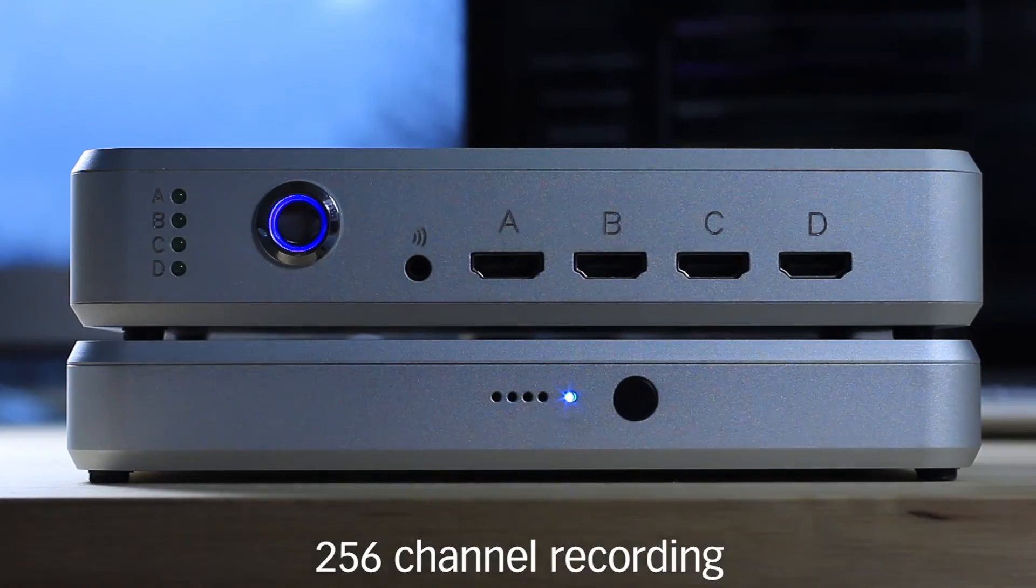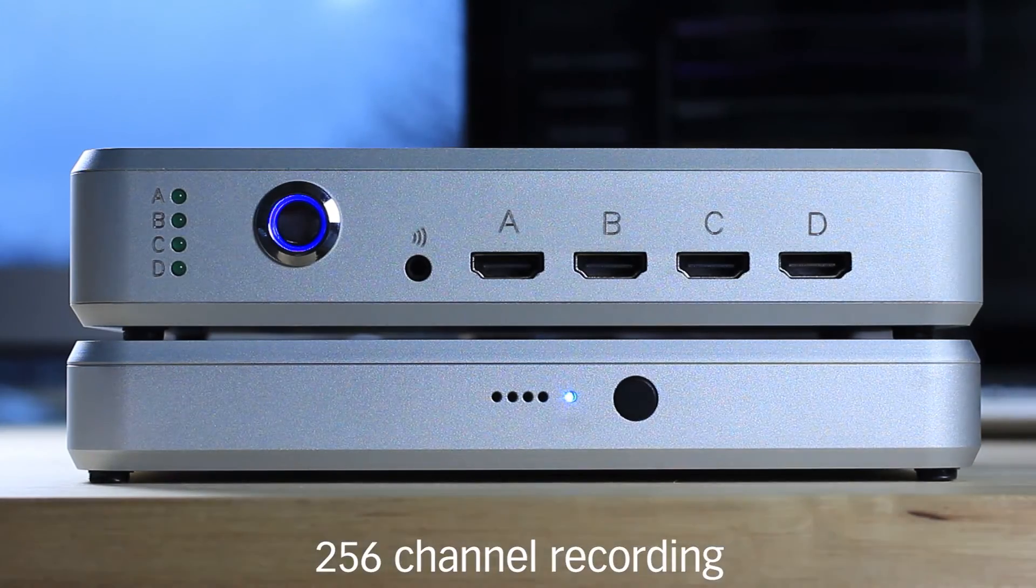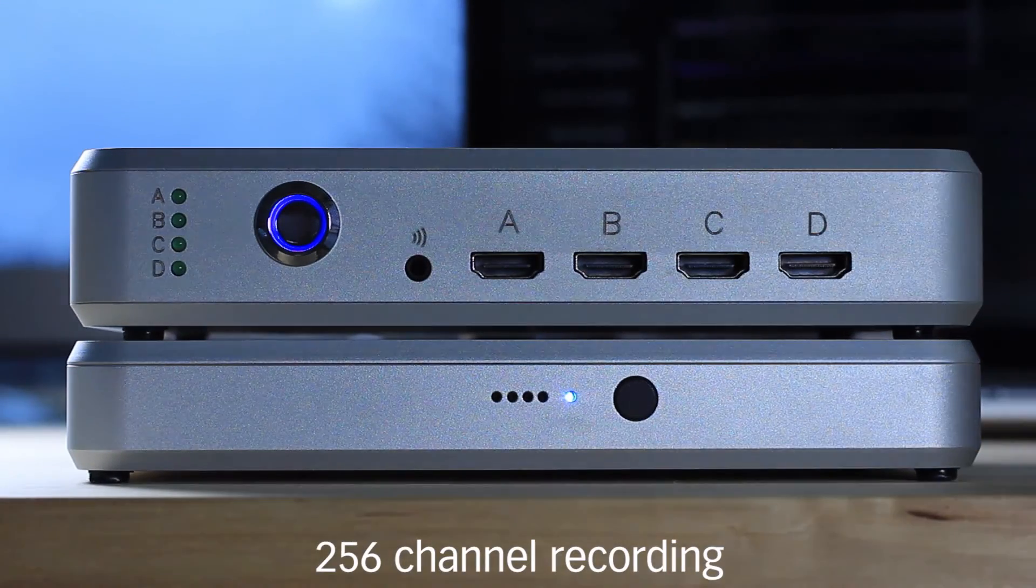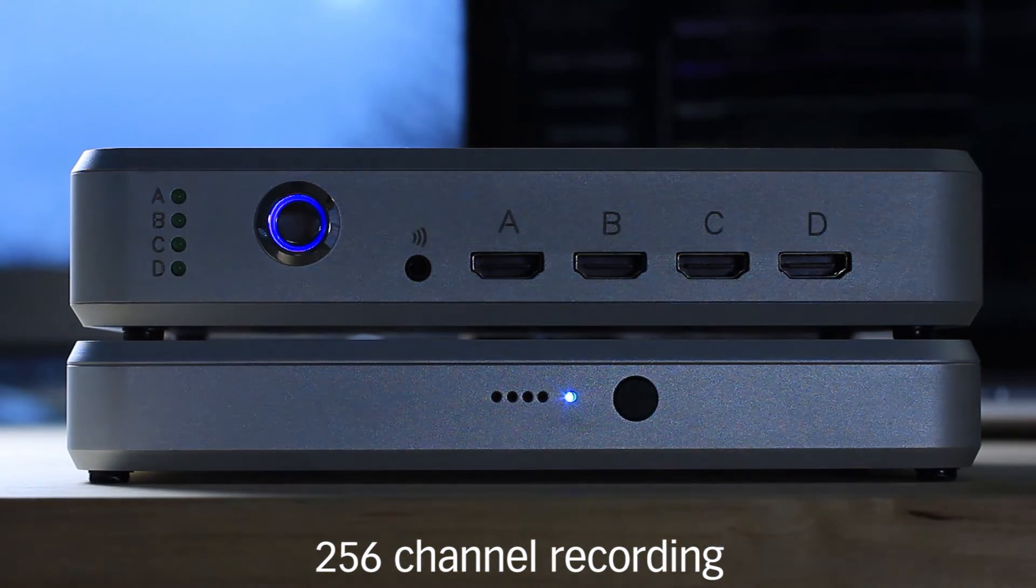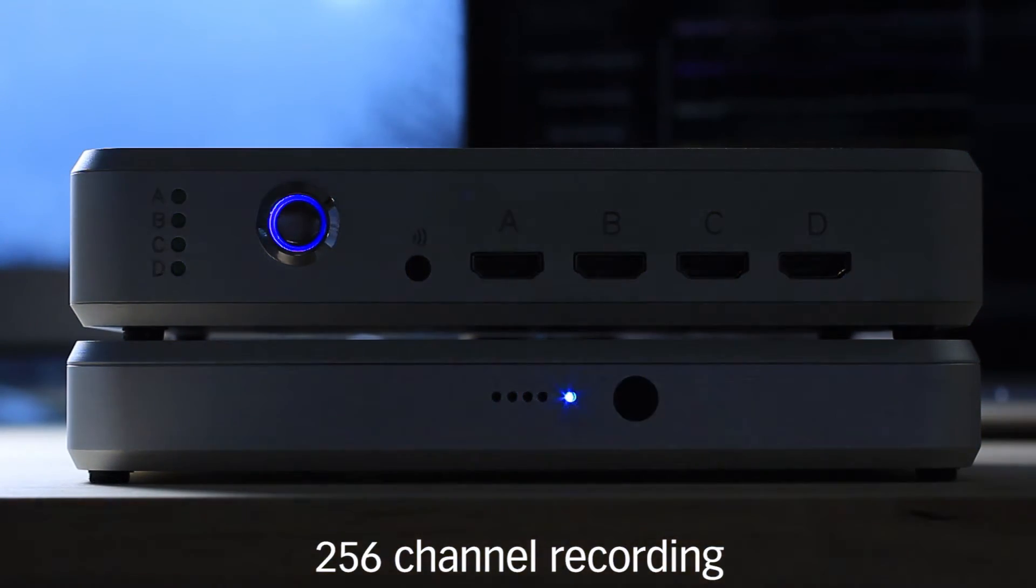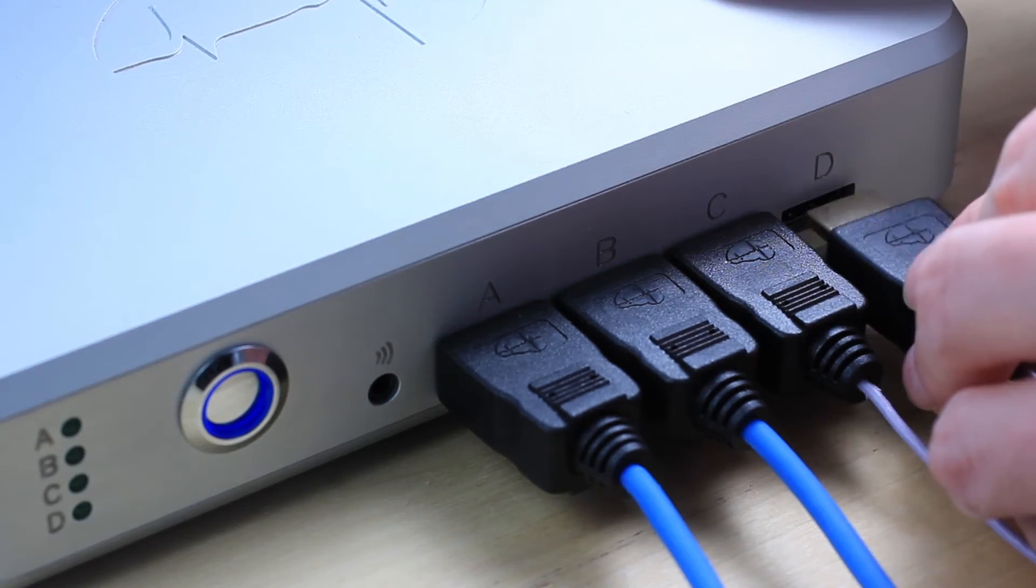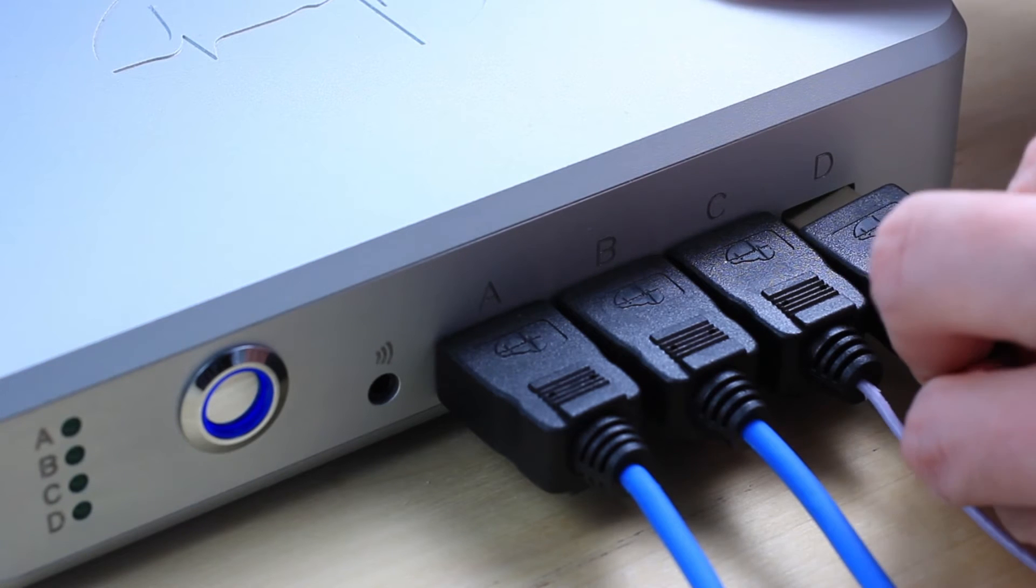The SmartBox maintains its ability to record up to 256 channels from up to four independent experiments.